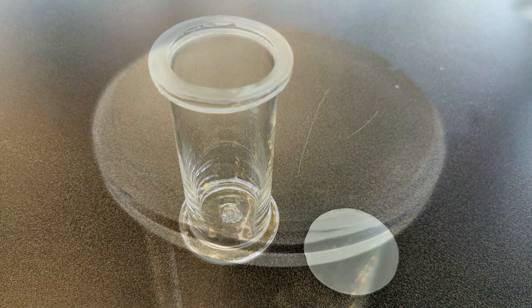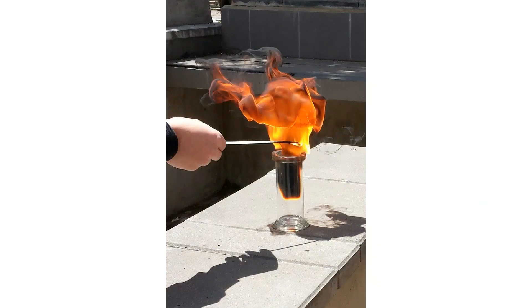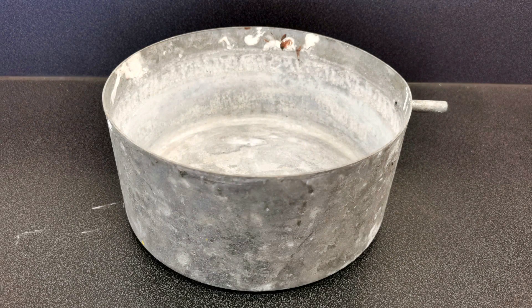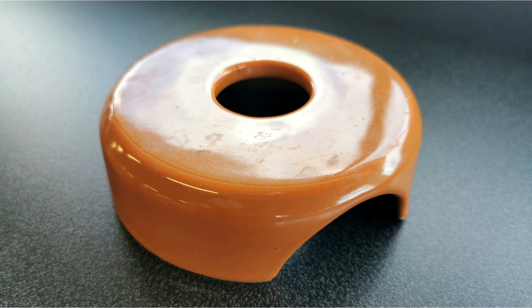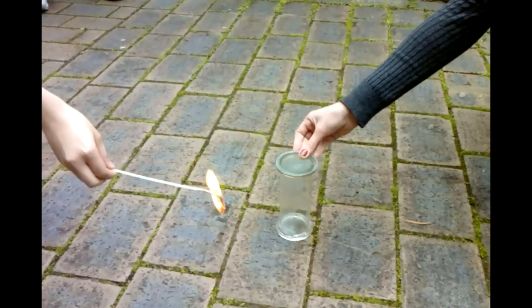This is a gas jar and lid. You might use a gas jar to trap some gas — in this case we trapped some ethyne gas, some acetylene gas. To make the ethyne gas you might use a trough — a water trough — and a beehive shelf. A gas jar upside down, completely filled with water, sits on the beehive shelf, which has an opening to fit a hose into. The hose comes from where water was dripped onto calcium carbide, producing ethyne gas, which comes through the hose and displaces the water out of the gas jar. Then you put the lid on, save it, go outside and light it — it's quite fun.